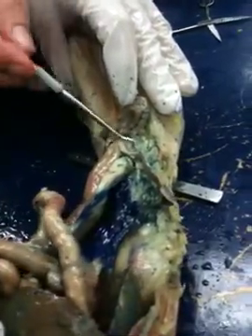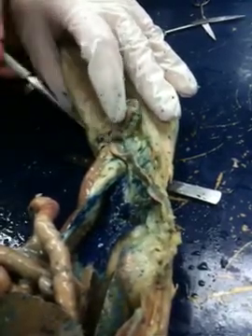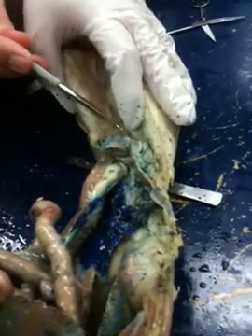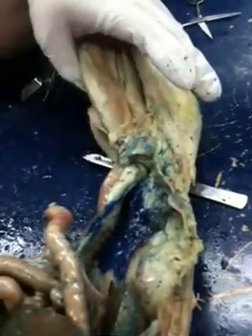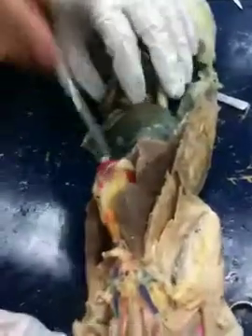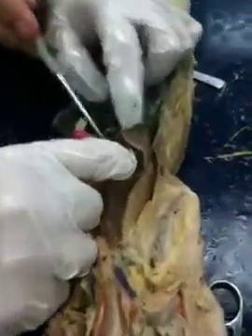Okay, this tube here and this tube here are your ureters. You're going to have to clean out a little bit more, but right here is your urethra. Right there. And then that's the bladder. Yep, and a bladder on top. What is this? That's their heart. And then your lungs. Where's the diaphragm? Right here, that layer right there. And underneath one? The very bottom one, this one right here.